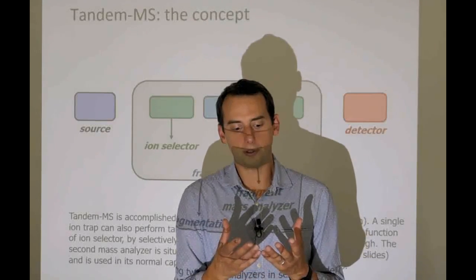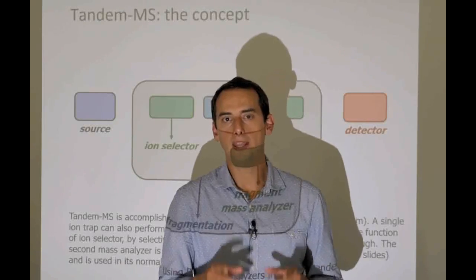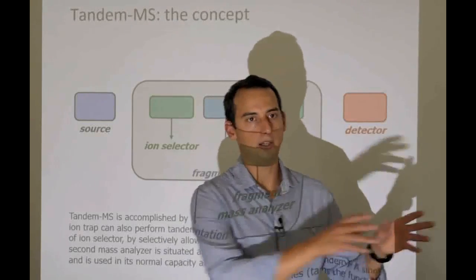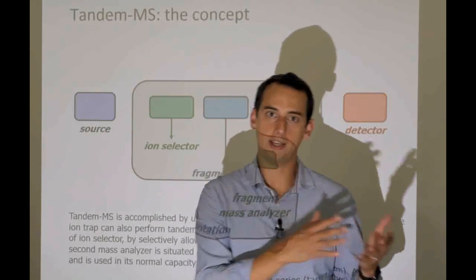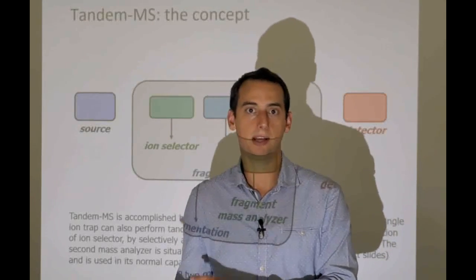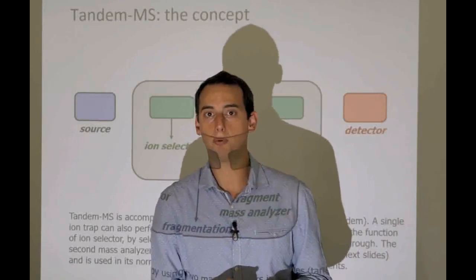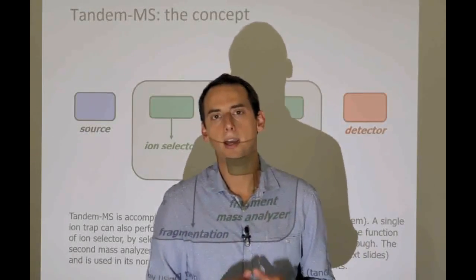So the solution might be to not look at the intact body weight alone. Imagine that we would weigh somebody, and then, and here's the morbid bit, we would then have to chop them into little pieces. We could weigh the arms, the head, the torso, and the legs separately, and then we could use the combination of the intact body mass together with the masses of the individual body parts we get after cutting them into fragments, and that combination is likely to be unique because two people who have the same body weight may not have the same weight of arms, legs, torso, or head.